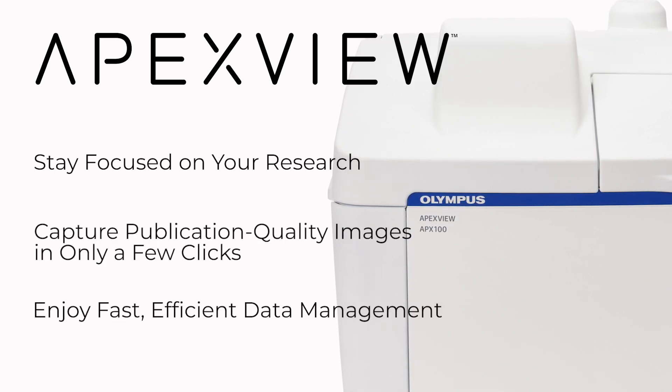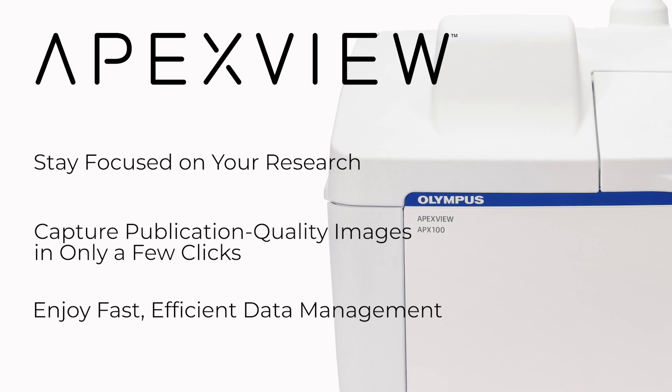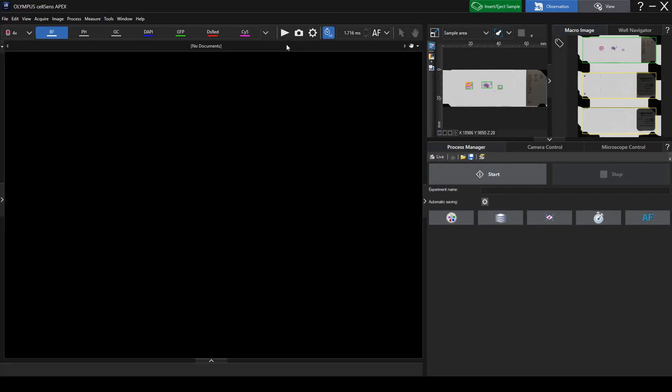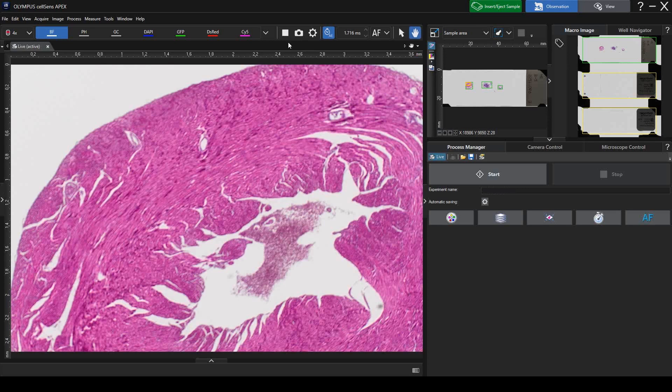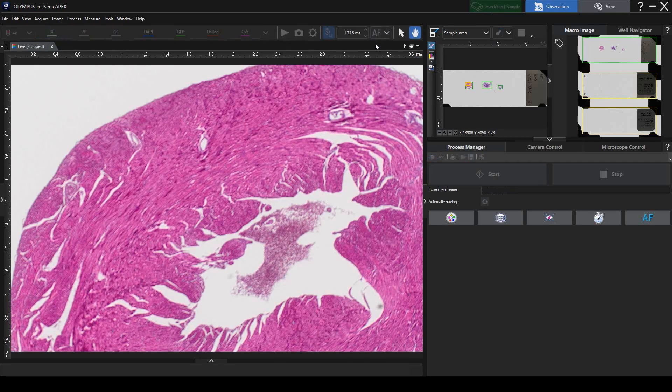Enjoy fast, efficient data management. A suite of smart features works together to make image capture quick and efficient to optimize your imaging workflow.